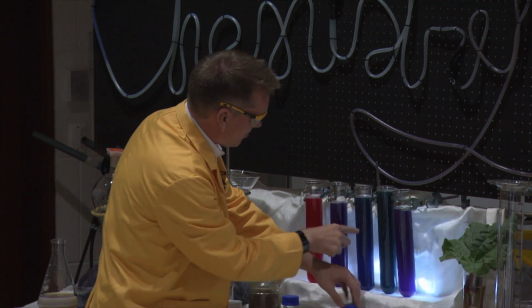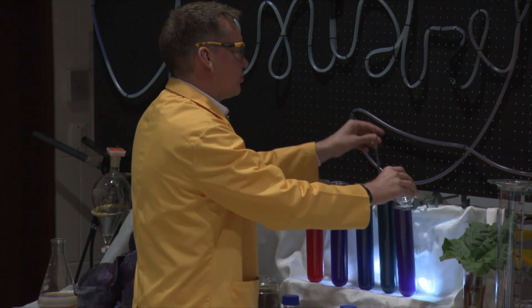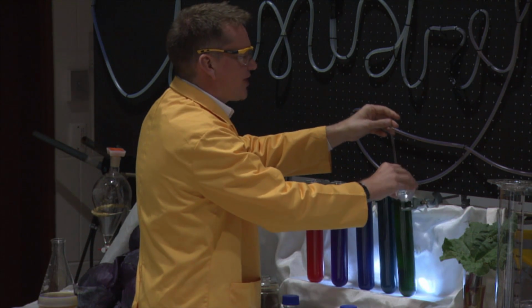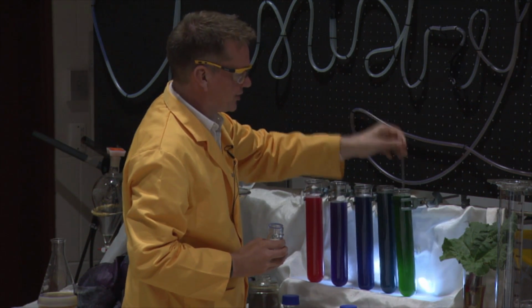So we've got red, purple, blue, green, and then this final one I'm going to add, well, this is also an alkali, like the calcium hydroxide, and that means it's the opposite of an acid. So acids give hydrogen ions, these ones, well, they mop up any hydrogen ions that might be in there.